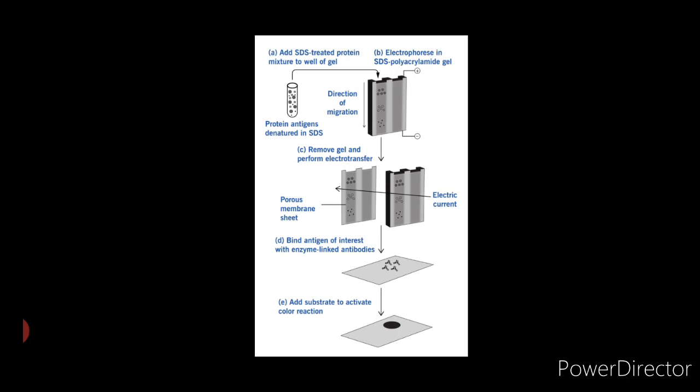Now let us understand the procedure of Western blotting. A typical Western blotting technique is largely analogous to the indirect ELISA procedure and comprises the following steps. Proteins of the sample are immobilized on a membrane surface either by direct application as a spot or by transfer from an electrophoretic gel. Several types of synthetic membranes bind proteins tightly enough while retaining antigenicity and accessibility to antibodies, and hence these membranes can be used as supports for immunoblots or Western blots.